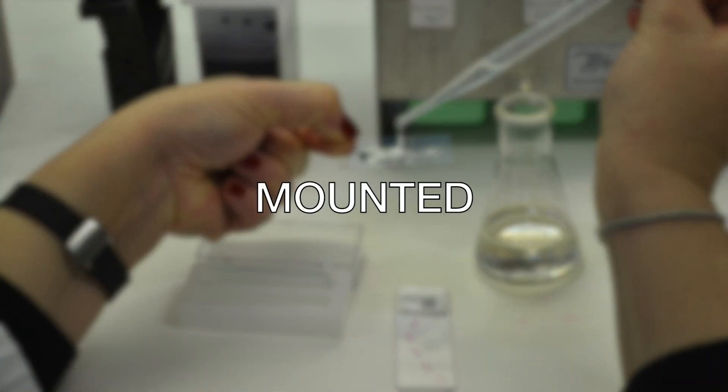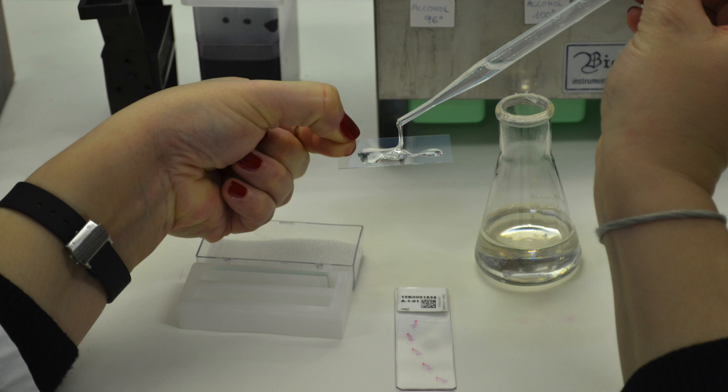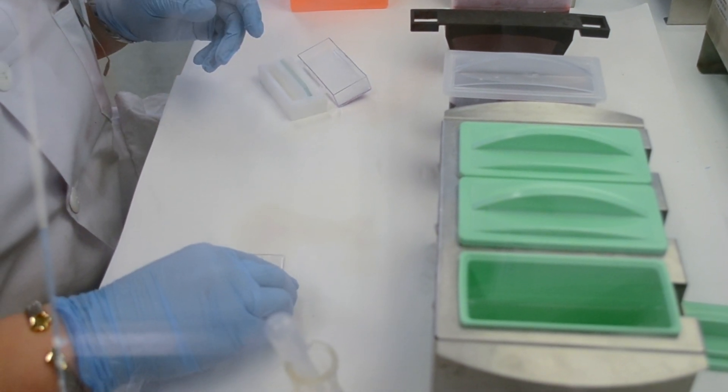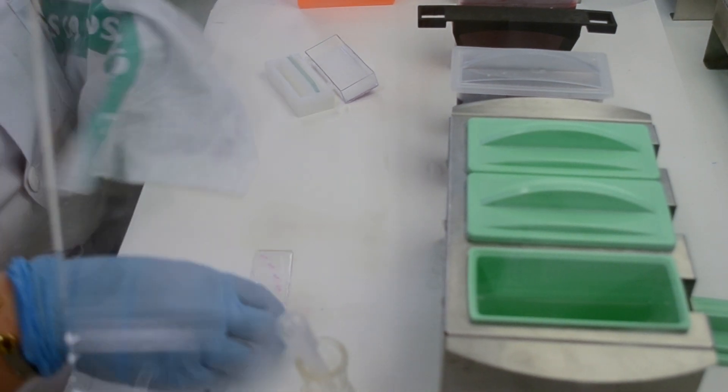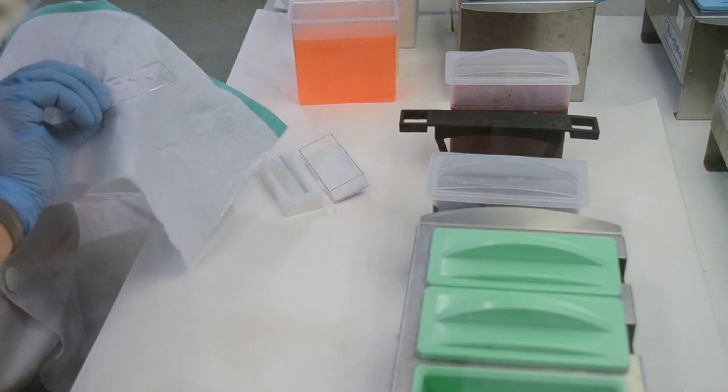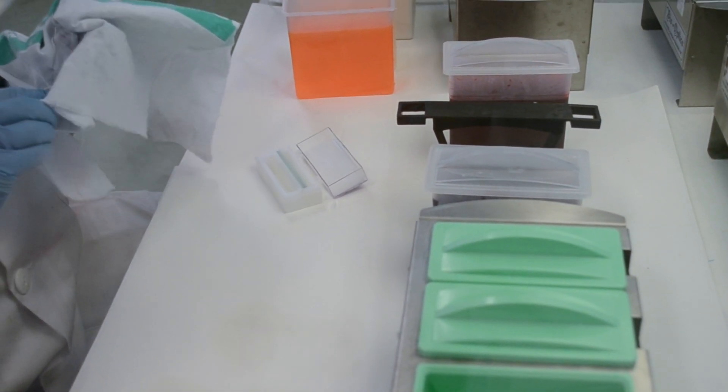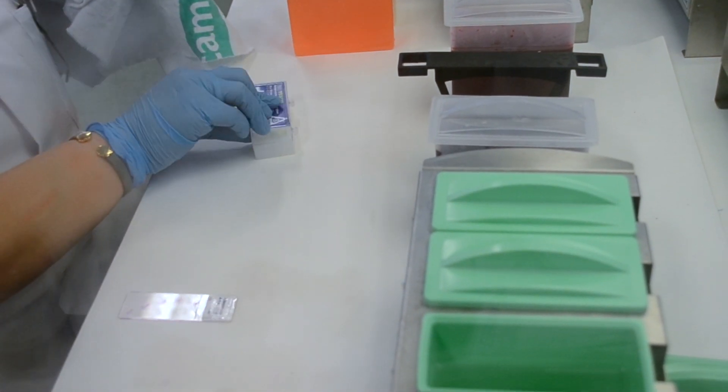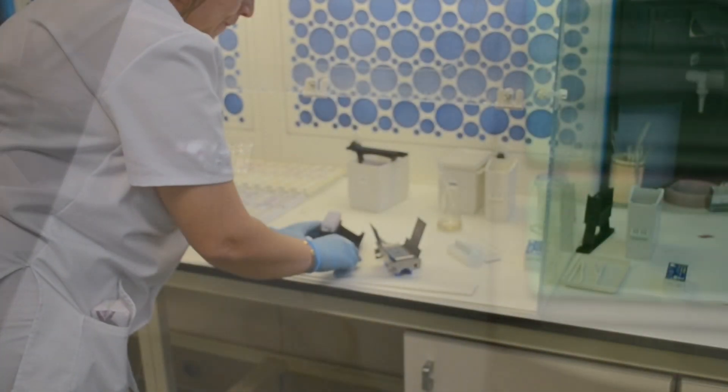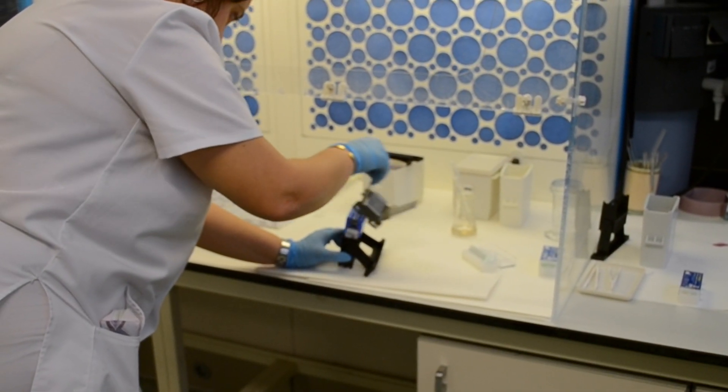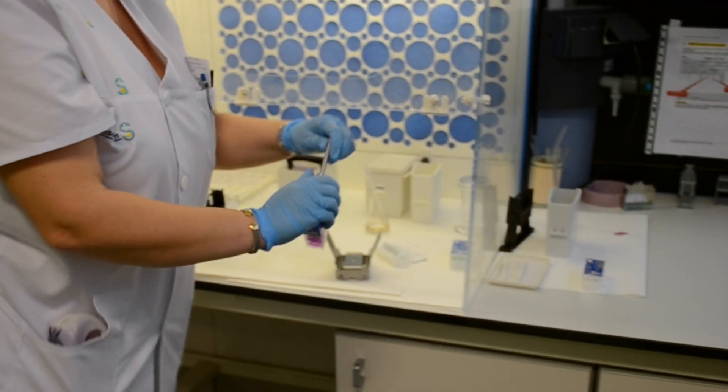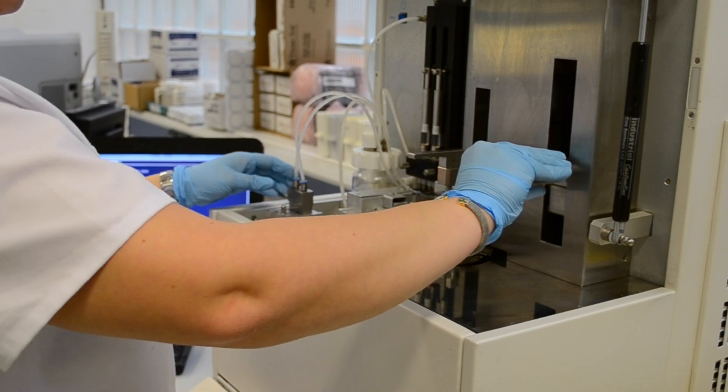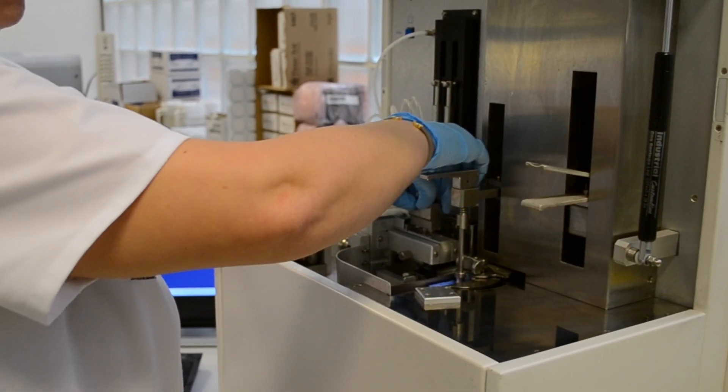Cover slipping, sealing, and mounting. Before viewing the stained sections with a microscope, they are mounted on a clear glass slide and covered with a thin glass cover slip. The cover slip is often glued to the microscope slide in order to seal off the specimen from contamination and decay. A number of sealants are in use, including laboratory preparations or mounting medium, usually non-aqueous. However, to use a non-aqueous mountant, the section must be dehydrated again and cleared. Any water carried over to the mounting stage will show up as bubbles or vacuole-like structures, as the water droplets aggregate and distort the tissue. The mounting of specimens on the microscope slides is often critical for successful viewing. This is done automatically in this machine and takes about 30 minutes.